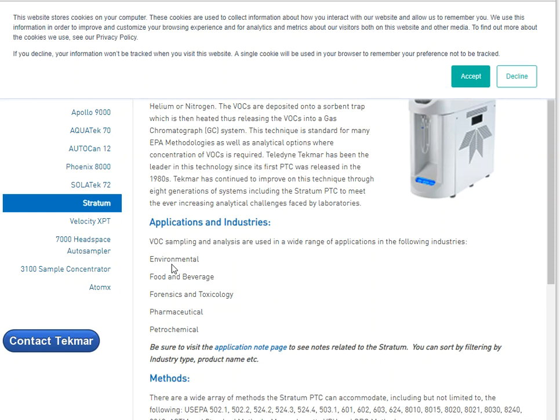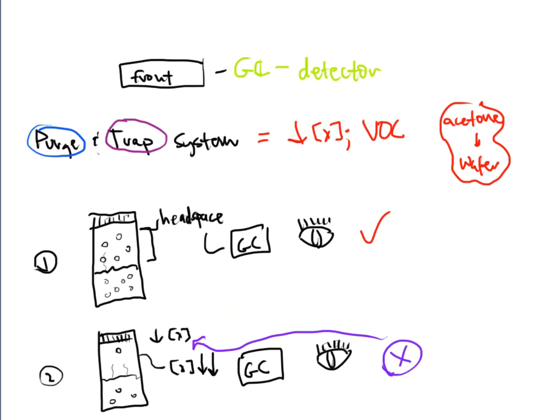Okay? So this is the piece that we're getting ready to talk about, and we're going to explain to you how this whole system begins to work. So we know low concentration work. This low concentration will evaporate just like all the others. The problem is that this headspace will also be low concentration, and we need to go through and beef that up a little bit so that our instrument can see it.